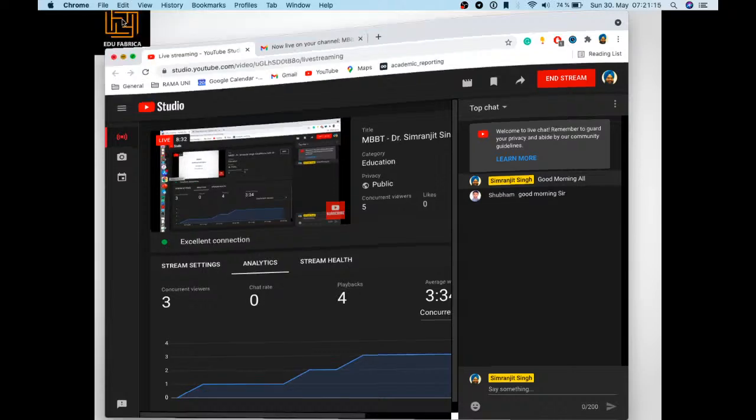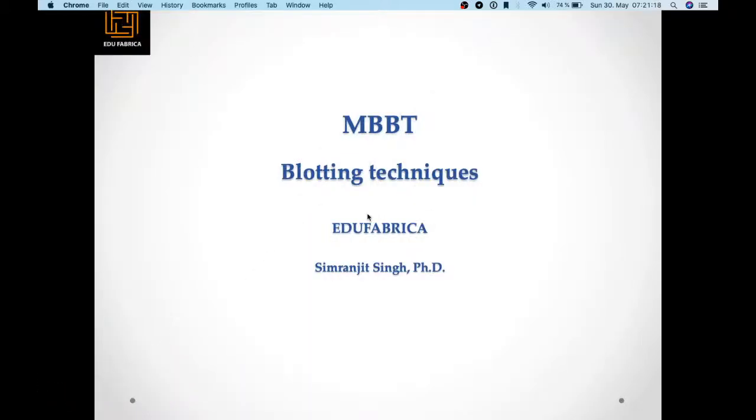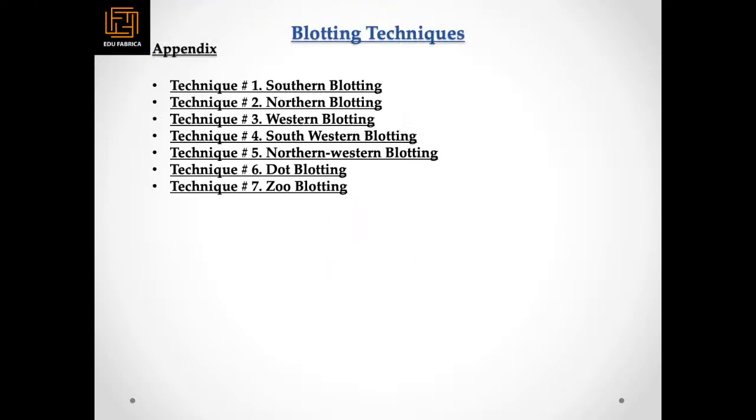So I will not make it big. I will just go for small topics today. I'm going to discuss blotting techniques here, that is, the techniques used to differentiate between your DNA, RNA and protein. There are around 7 techniques: Southern, Northern, Western, and others.